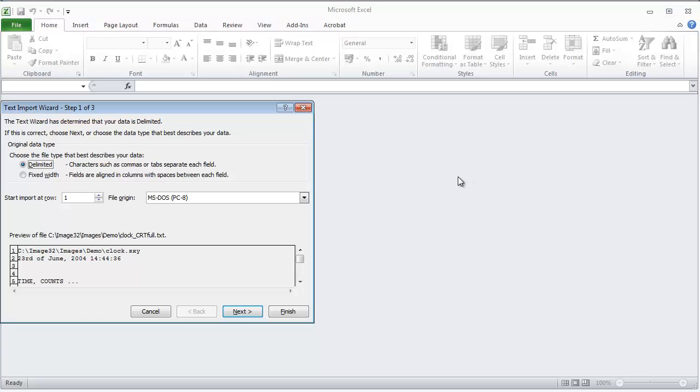So we'll now go into Excel, and I've done a file open, and we've got to the text import wizard, and what we can see here is the contents of the file, and I'll just show you some of the points that we're interested in. We've got the time, the odd area profile 0, 1 and 2, and then we've got a list of comma separated values.